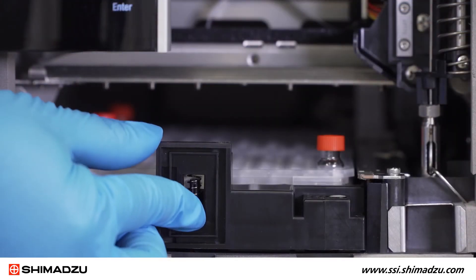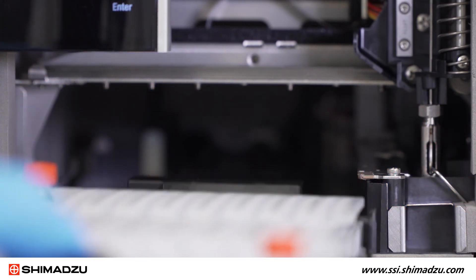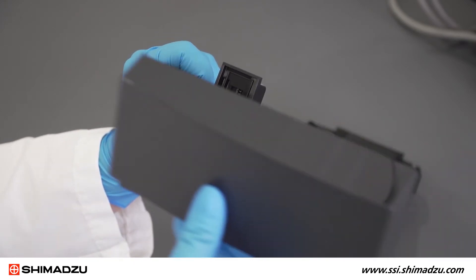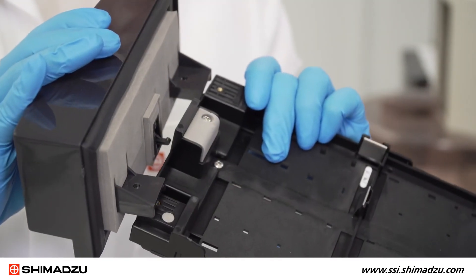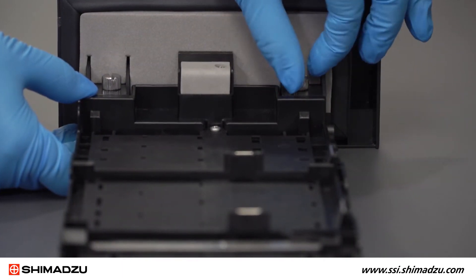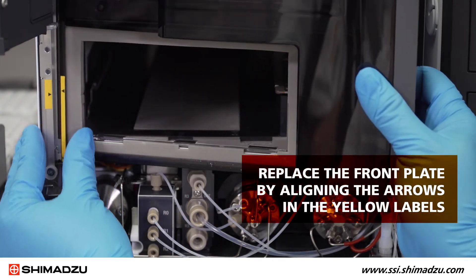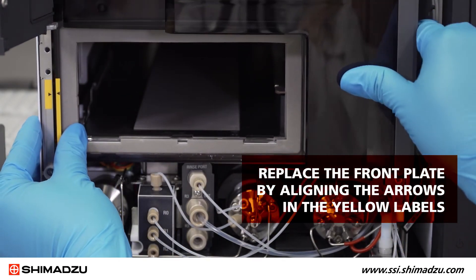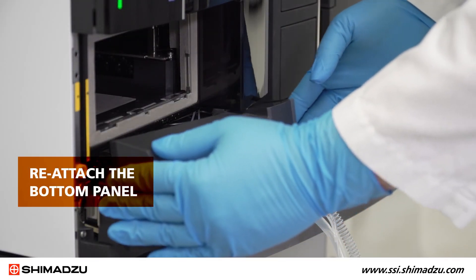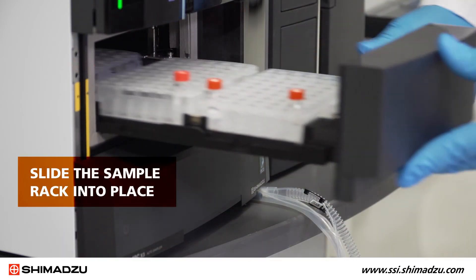Now you can remove the sample rack. Be sure to press the spring-loaded catch. Next, reattach the front panel to the sample rack by pressing down on the spring-loaded catch and inserting the plastic rod on the panel as shown. Then you can secure the rack panel in place with the two knurled screws. Replace the front panel by aligning the arrows in the yellow labels on the left, then press the right side of the panel to lock it in place. Reattach the bottom panel, then slide the sample rack into place.